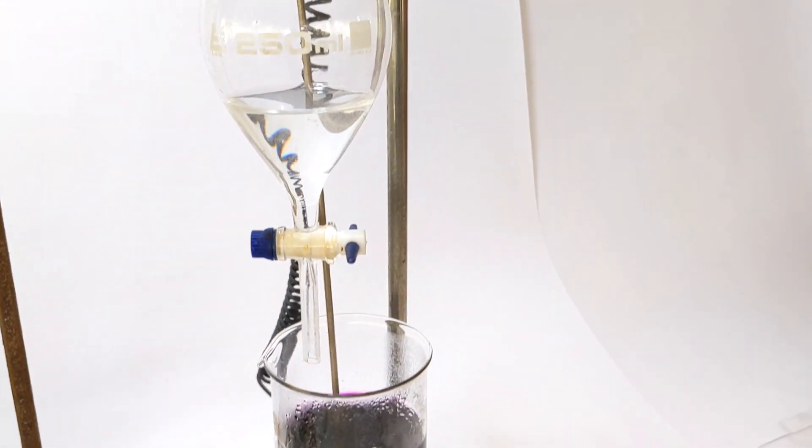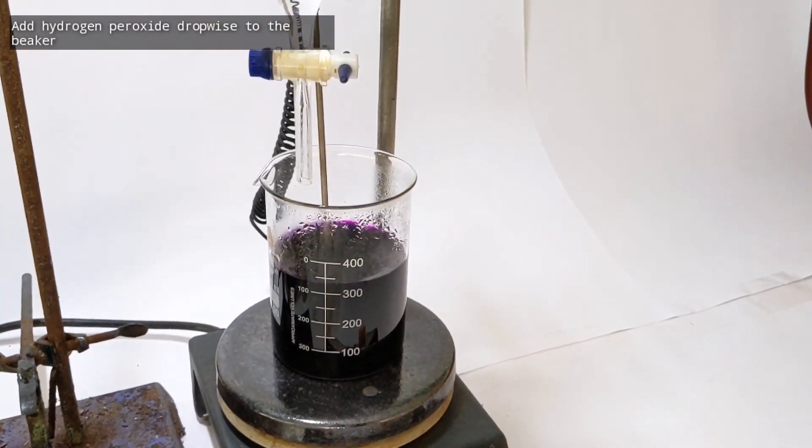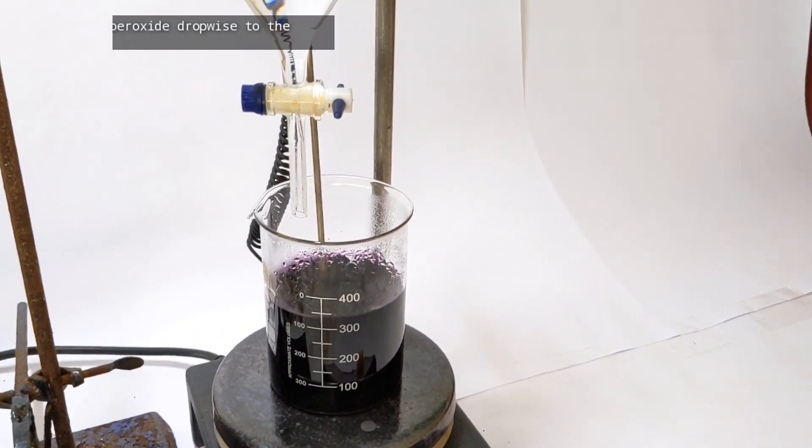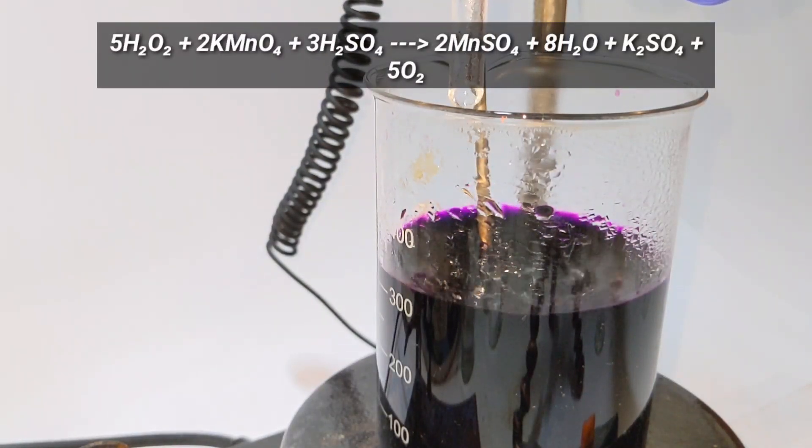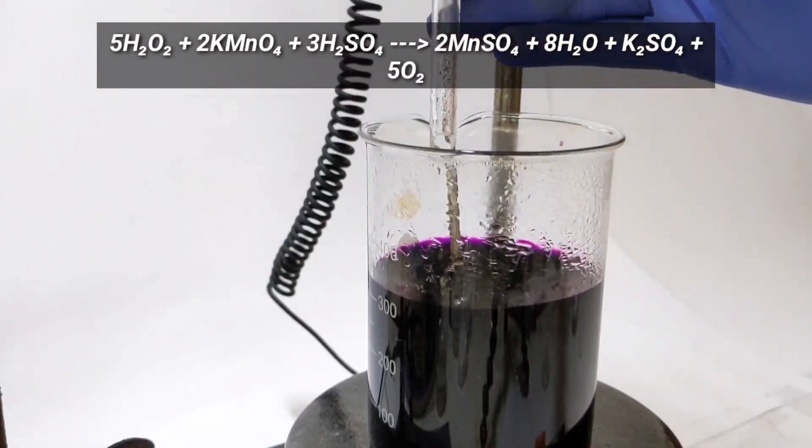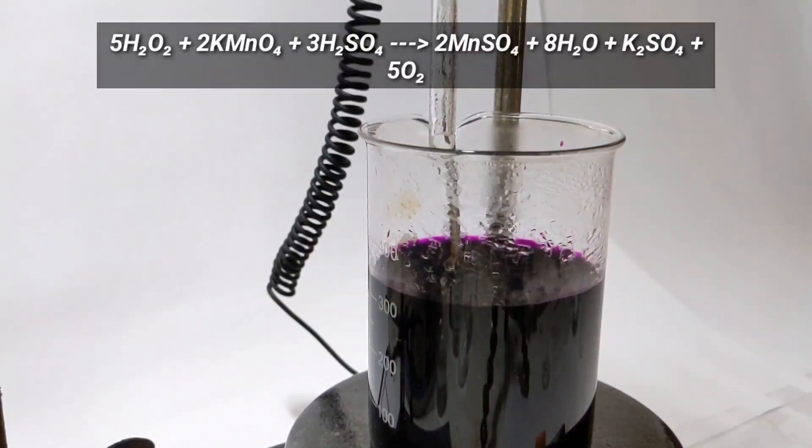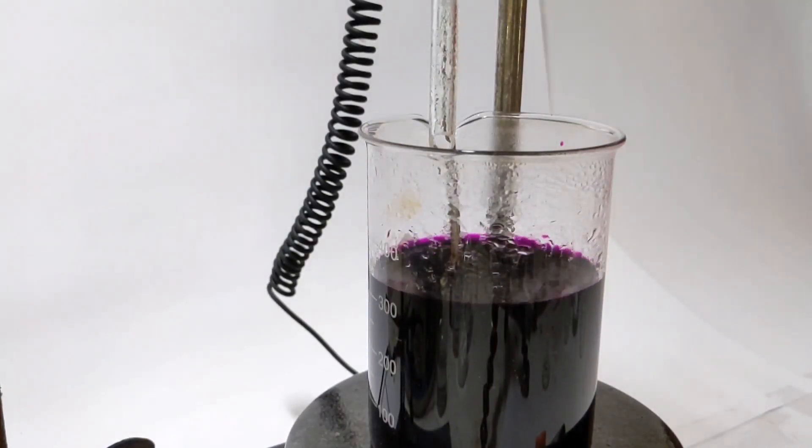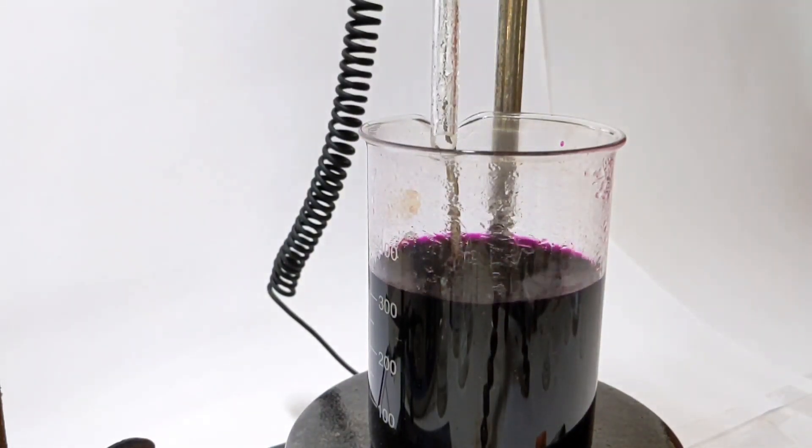What is happening here is a redox reaction. The potassium permanganate, the permanganate ion, is getting reduced to the manganate +2 state. This in turn forms the oxometallate complex with the molybdate.